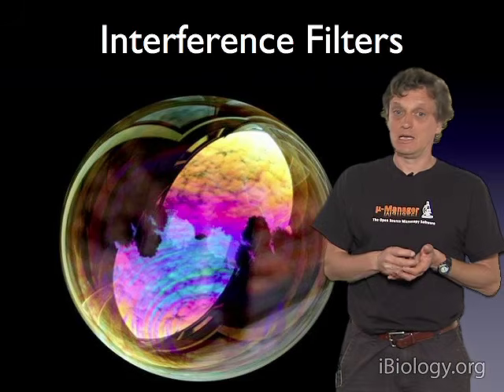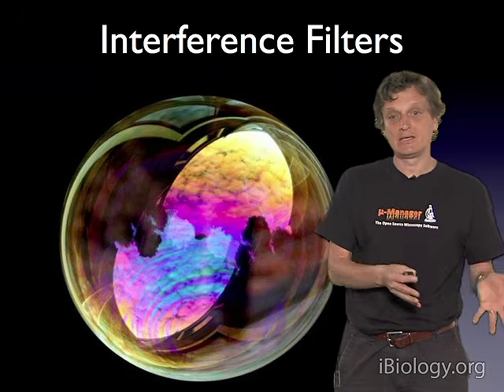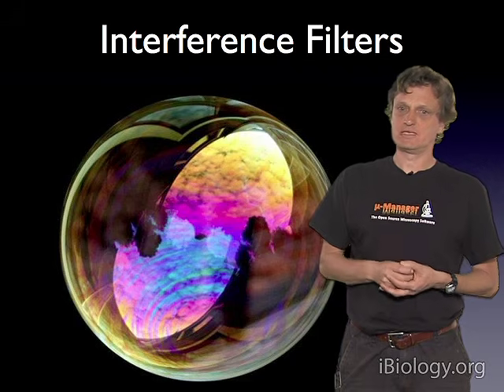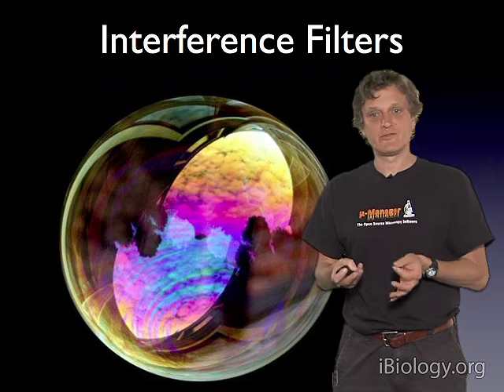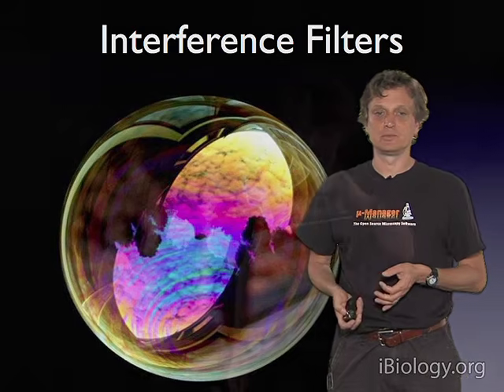Now we will break and show you some of these filters, and we'll also show you here how these filters are assembled in a filter cube.